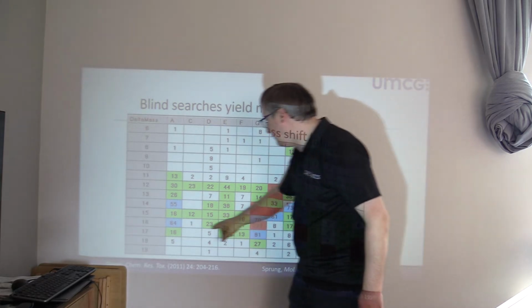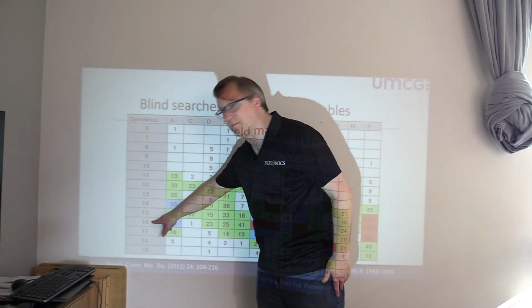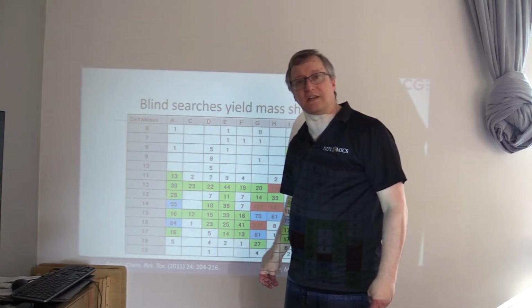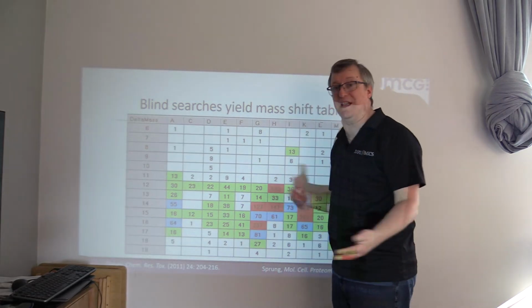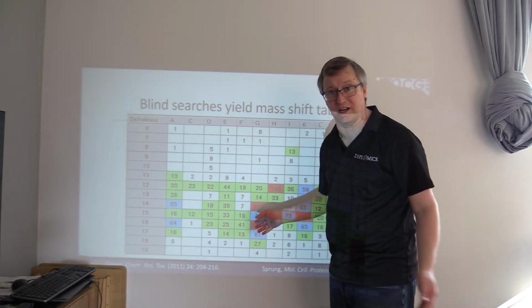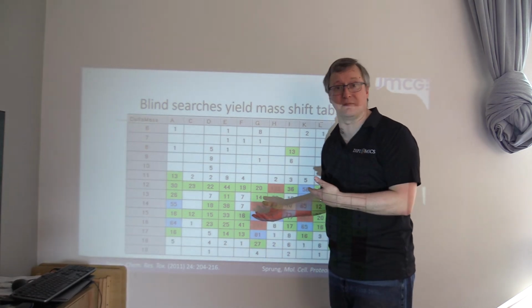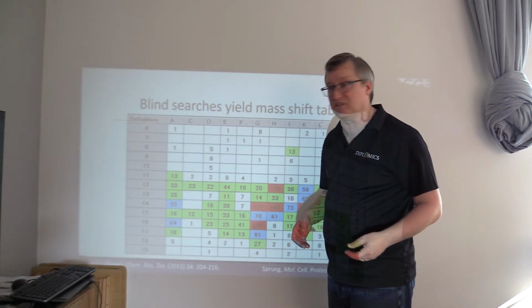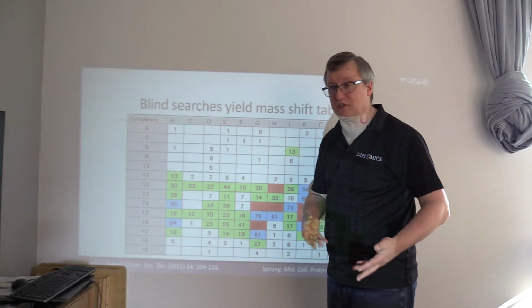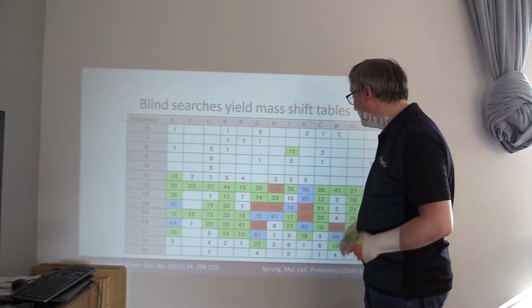And if we look over the row, we see that 16 is showing up. So in this case, the oxidation of methionine is the most common mass shift seen in all of these data. Not surprising, because formalin-fixed, paraffin-embedded samples are in contact with the atmosphere, and even before they come to your lab, they already bear a large amount of oxidation in them. All right.